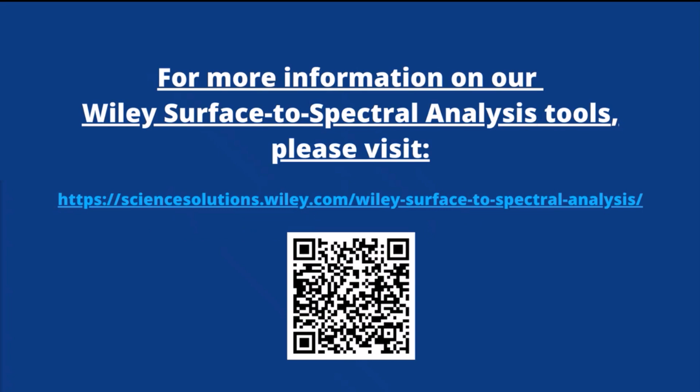And when you click that button, it allows you to send the spectrum that's in focus to KnowItAll. Once in KnowItAll, it automatically searches that spectrum against any databases that you have licensed within KnowItAll to search for a spectral match. Great. Thank you again, Liana.